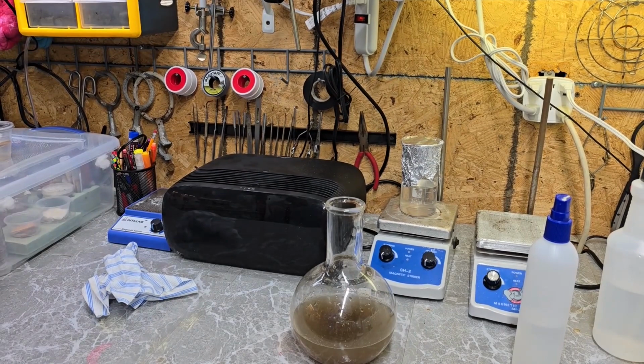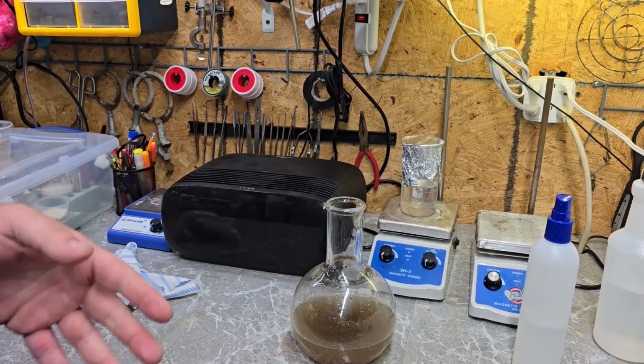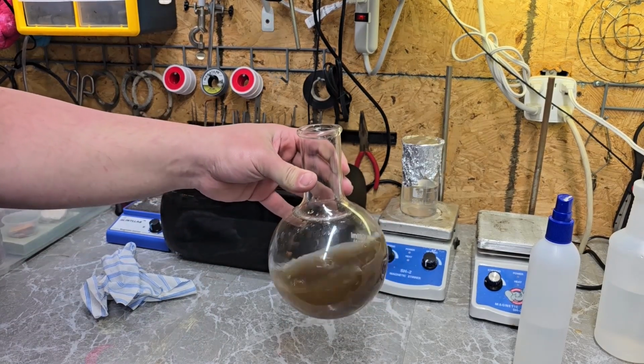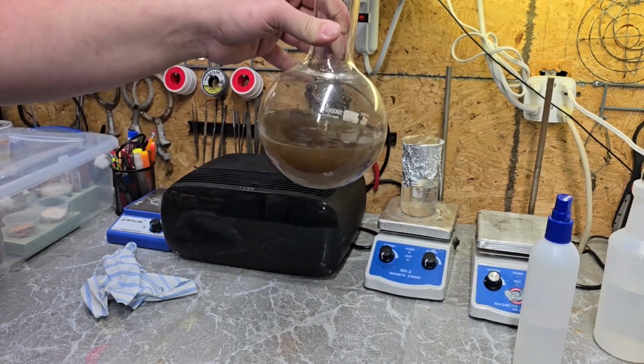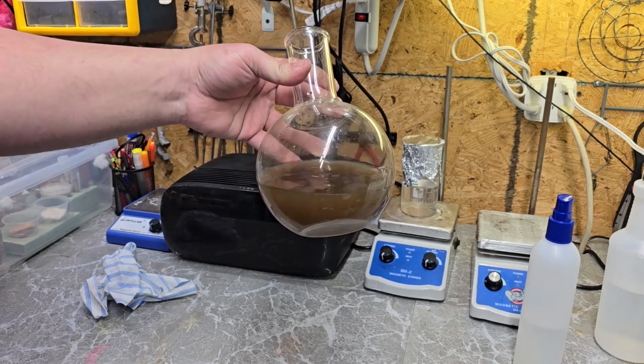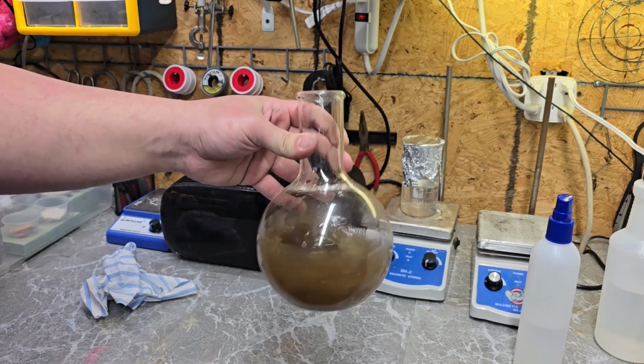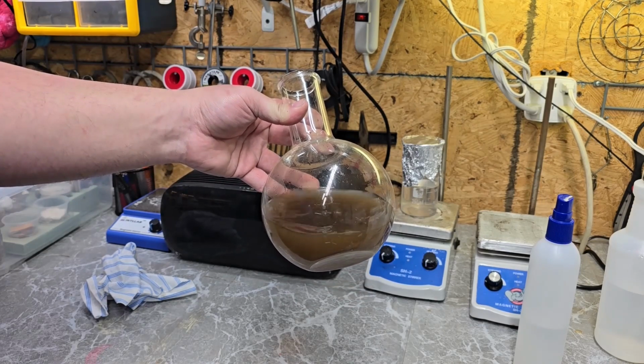Okay, I have that. You can hear the air conditioner and my filters are still on out here, but that's not really that big of a deal. You can see that I have a fairly decent amount of the solution that came off from washing that moss and stuff. So hopefully we have some little critters in here.